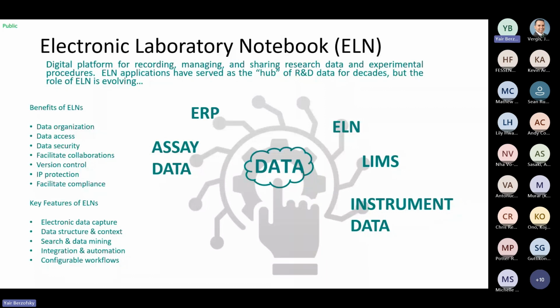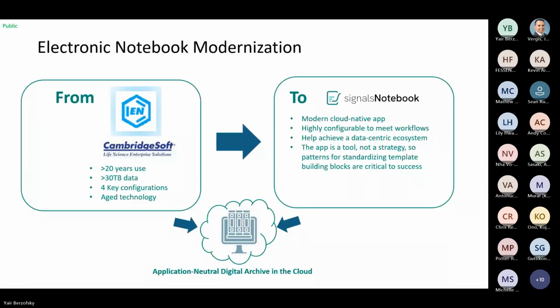For the next few minutes, I'm going to take you through Merck's journey to modernize our electronic lab notebook and configure it to positively contribute to our data ecosystem. So Merck implemented a Cambridge Software notebook. Now they call it Revvity. Cambridge is no longer there.